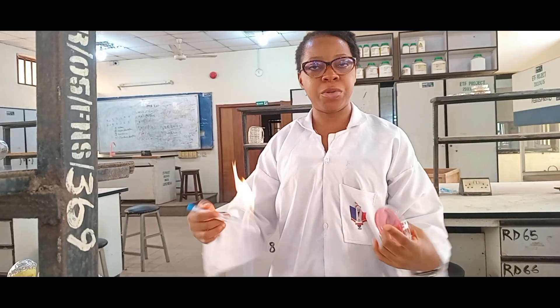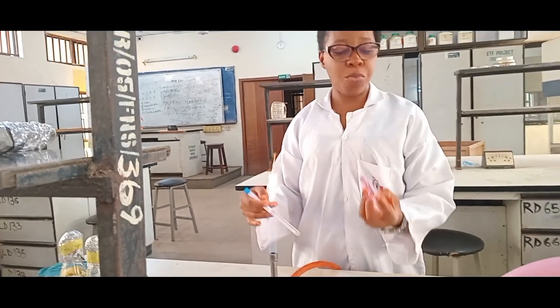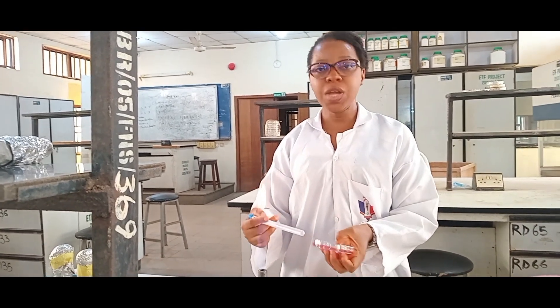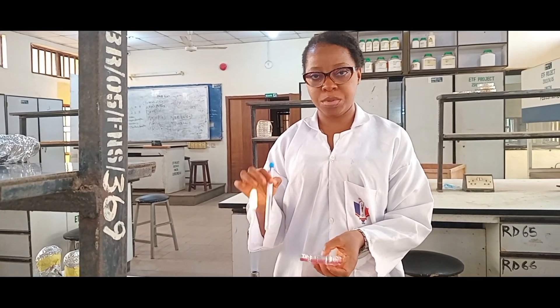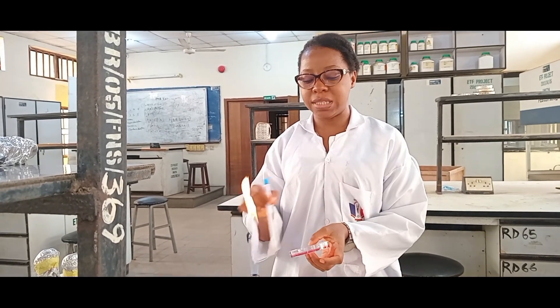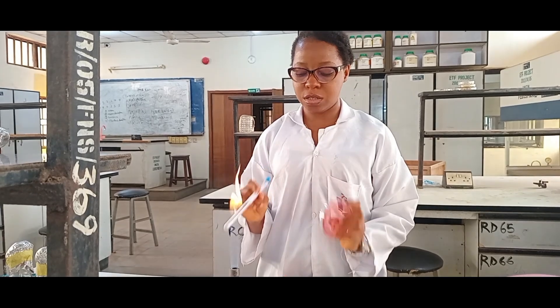What I do is take my swab stick, open the plate a little near the Bunsen burner flame — the flame ensures this environment is sterile — then swab all around. I rotate the swab stick and also rotate the petri dish, swabbing all around to make sure that every area of the plate is covered.